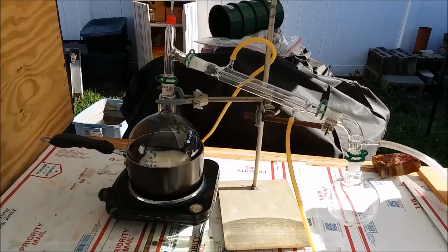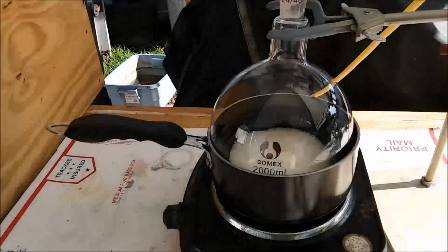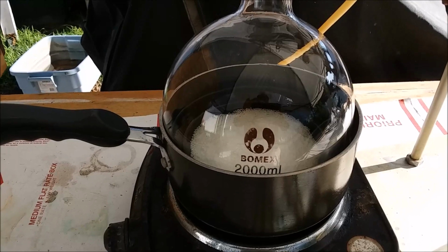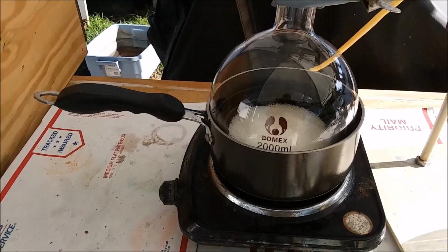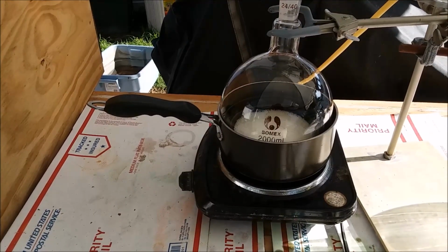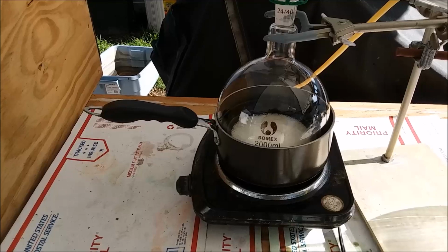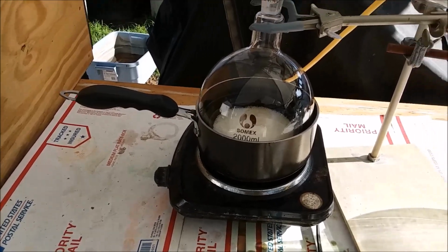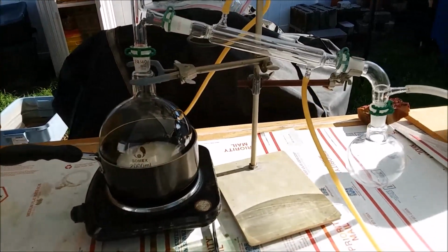But then I got to thinking, if I'm going to buy another boiling flask, why don't I buy a bigger one? So now I've got a 2-liter boiling flask. And it was a bit of a struggle to find a pan big enough for the oil bath that I wouldn't mind sacrificing for this and not using for cooking again, but I found one. So I'm going to be making a lot more nitric acid on this run.